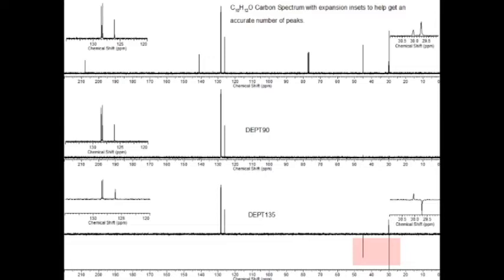It's interesting to note here that the most upfield resonance in the carbon spectrum is not actually the methyl. It's one of the methylene groups. Kind of curious that it works out that way. It's not common. Finally, there are 2 quaternary carbons indicated.